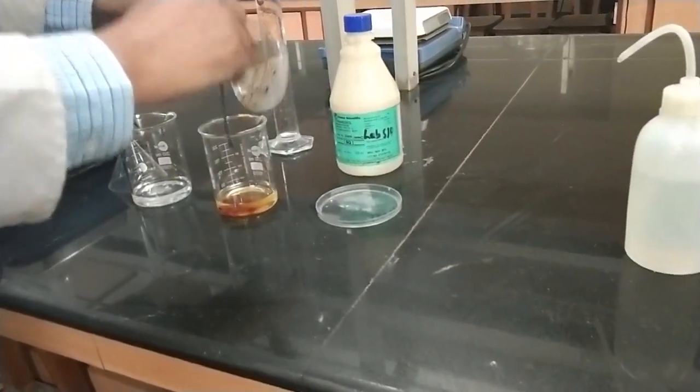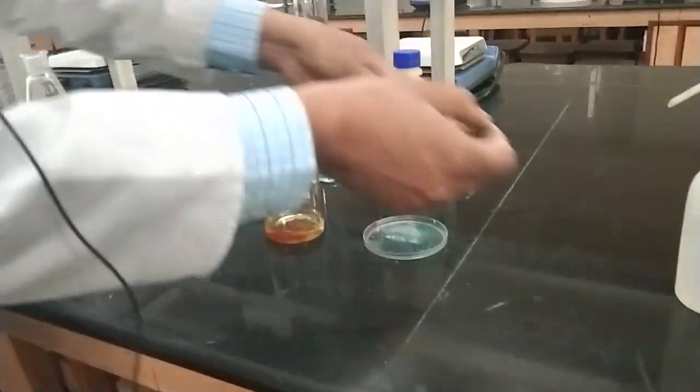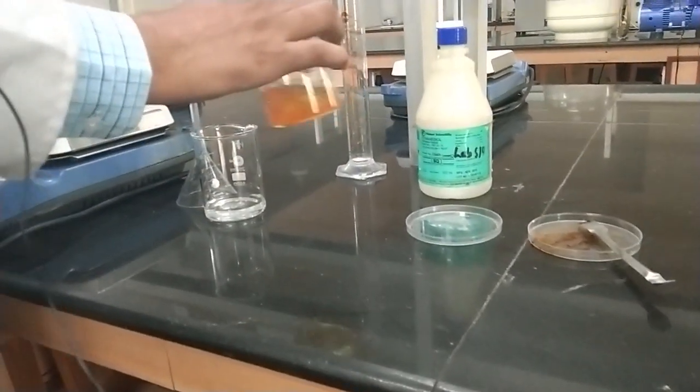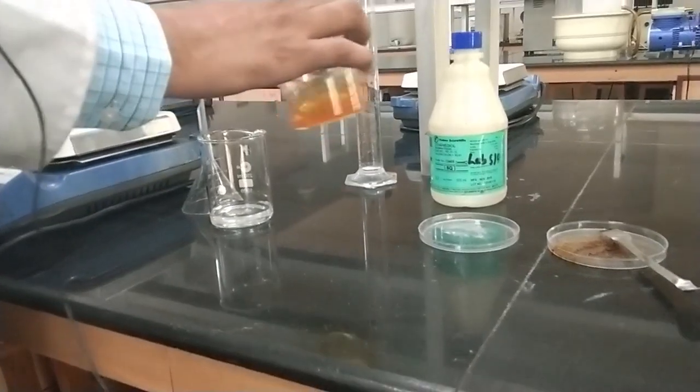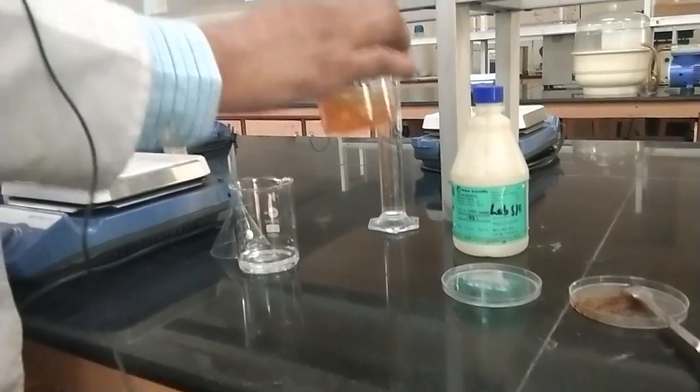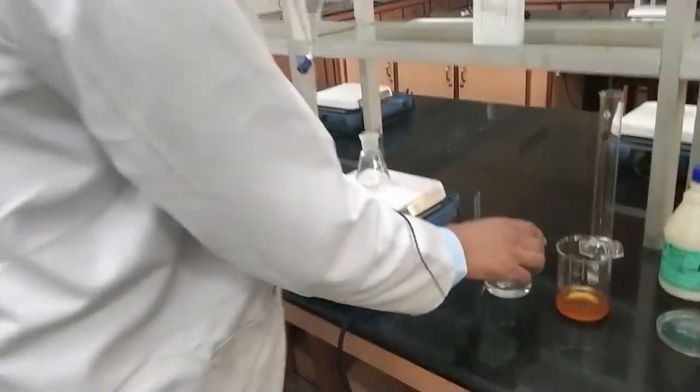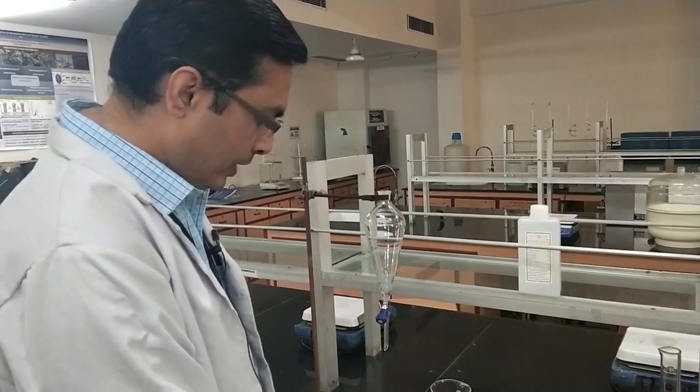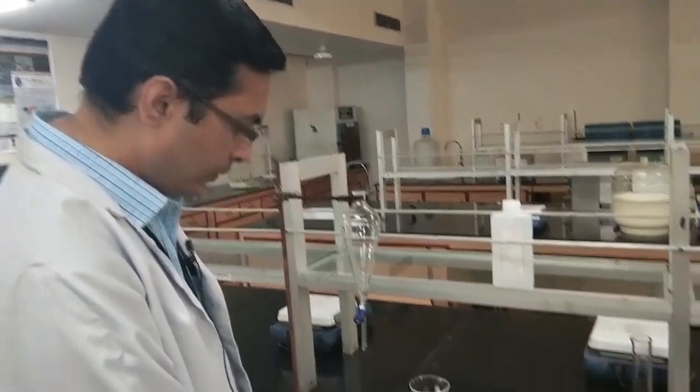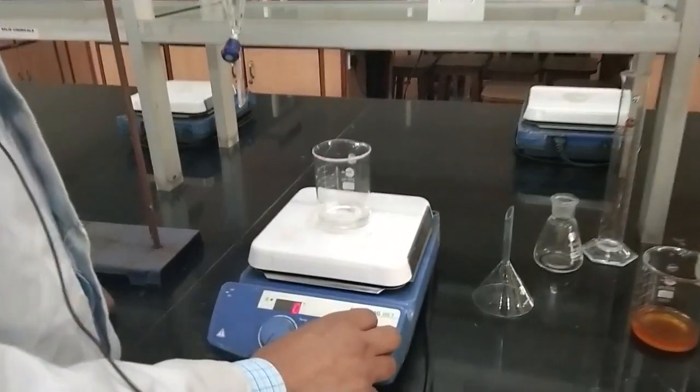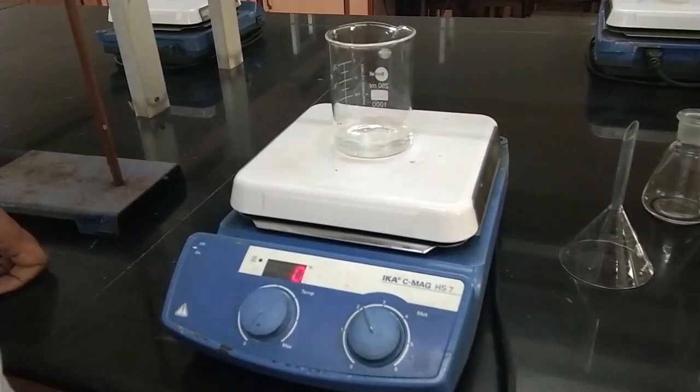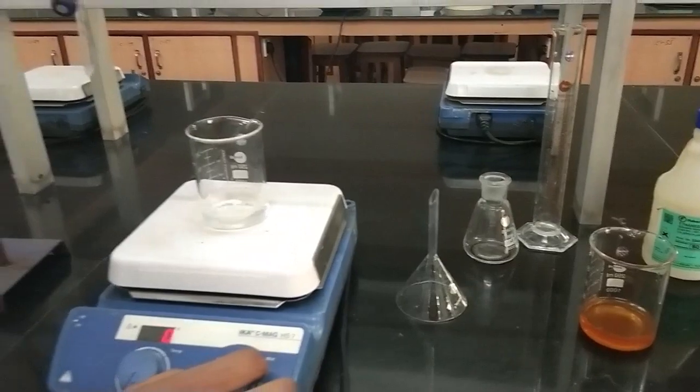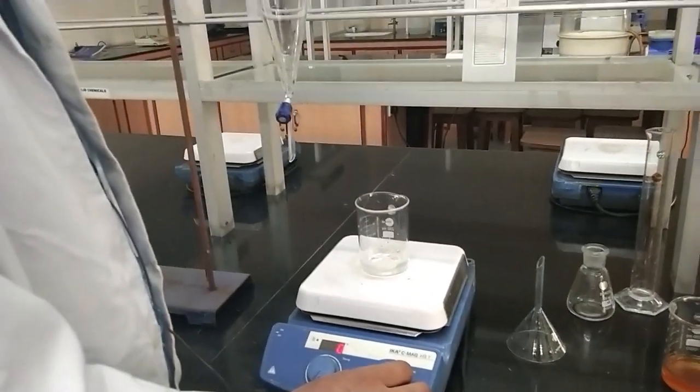Our iron 3 chloride solution is ready. However, the sodium pyrophosphate is taking a little bit more time to solubilize, so we need a little bit more stirring in order to completely solubilize it.